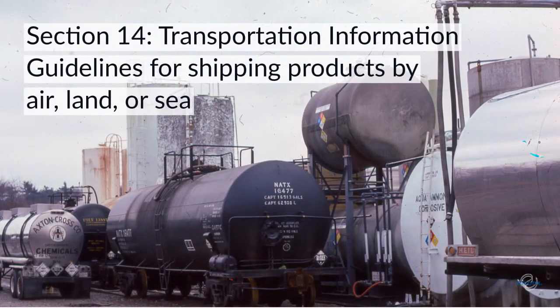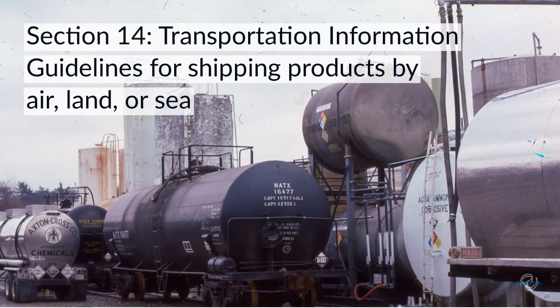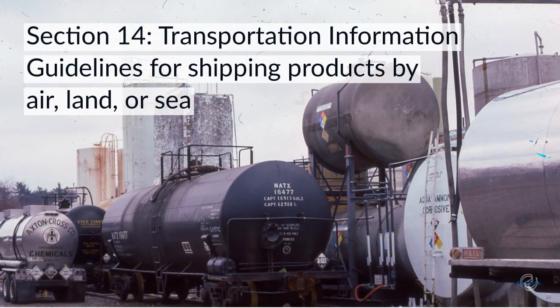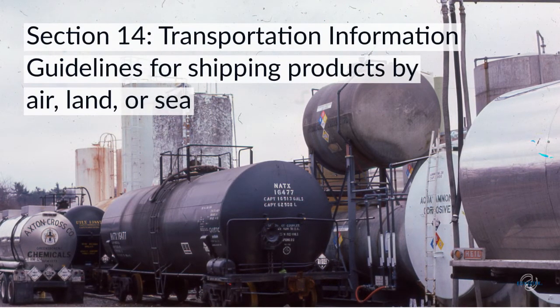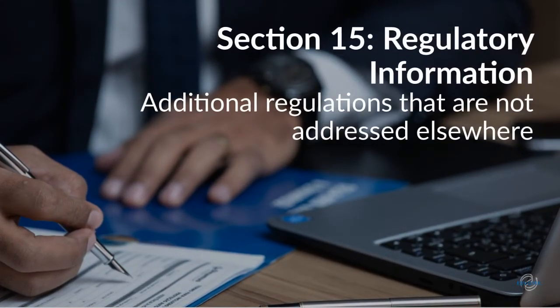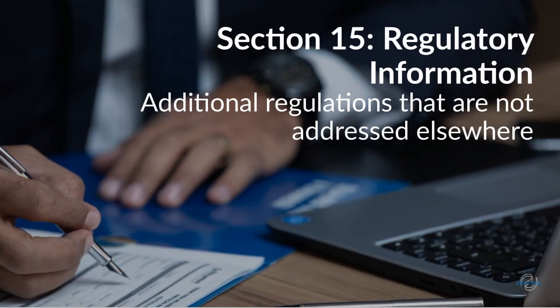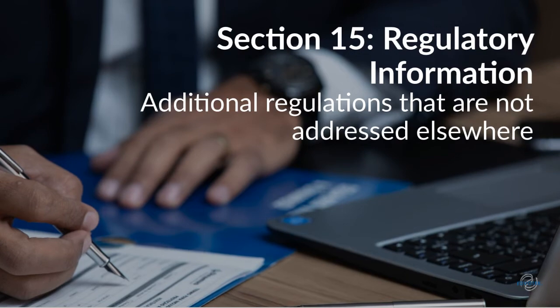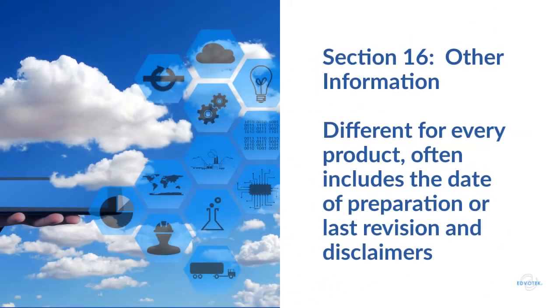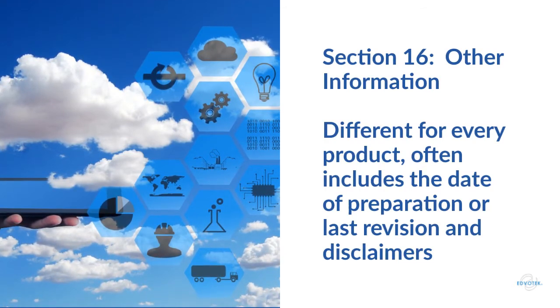Most of the information in Section 14, Transportation Information, will be used by suppliers as they ship products via air, land, or sea. If there is additional safety, health, or environmental regulations for a product not mentioned in any other section, it will be noted in Section 15, Regulatory Information. The final section of the SDS comprises any additional information, including the date of preparation or last revision, and any disclaimers.